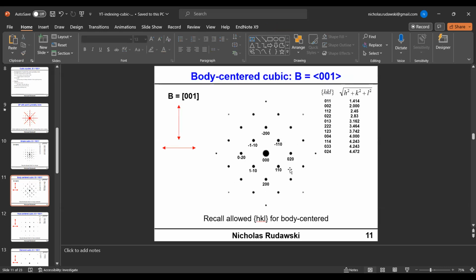That's the solution if I apply the soft rules. Now, I could have assigned any of these. Once I stipulated the zone axis was 0, 0, 1, I could have assigned any of these 4 closest spots to be 1, 1, 0, and I would have got the exact same answer. The only difference is that answer would have been rotated relative to the answer you're seeing here. But I could have just re-rotated the pattern back and got it back exactly as it is here. So you can imagine I could take this whole pattern and rotate it 90 degrees.